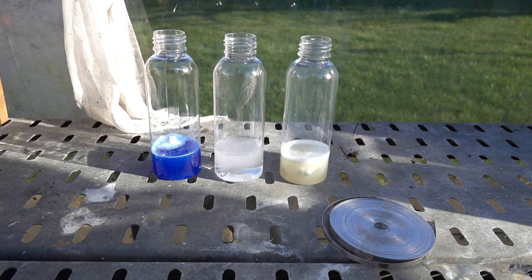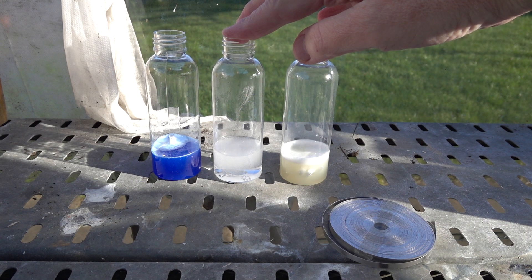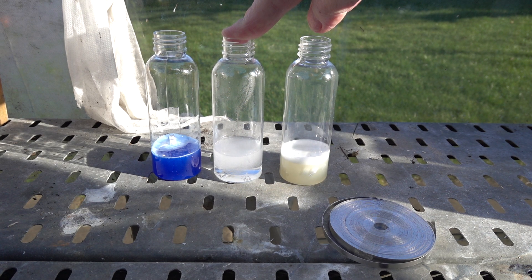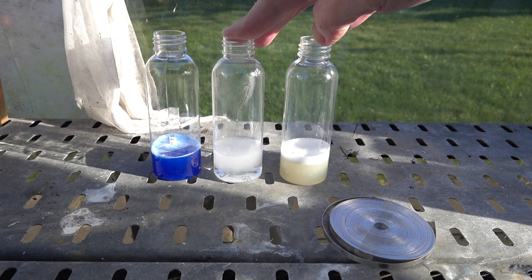One of the questions is: can we trap enough gas to test with a lighted splint? Let's try putting a finger over the top of one of the containers — the ethanoic acid here. The volume in the headspace of each bottle is much greater than the amount of gas being produced, such that I can feel no additional pressure on my finger. If it is hydrogen, we'd expect it to rise to the top of the bottle and perhaps give a positive test with a lit splint.